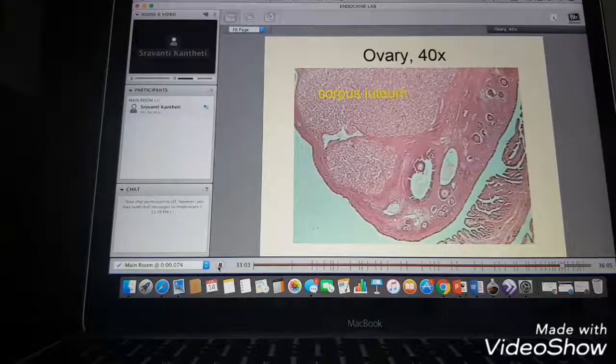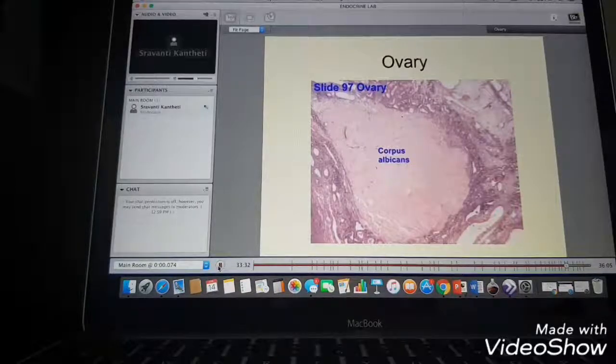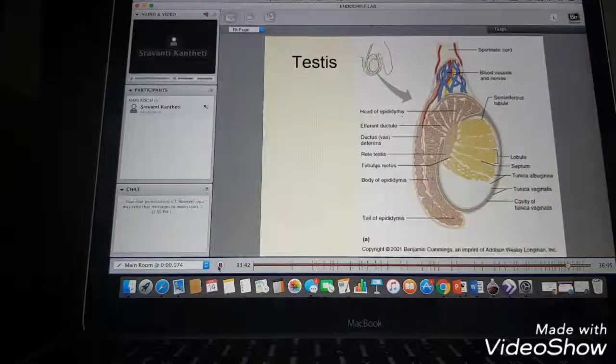This is absolutely neat because this is the egg getting ready to... Oh, let's take a look at that. See? Very cool. Okay, so ton of ovary. We have an entire chapter on this, so don't even worry about all of that. Just know that it's ovary, and here's that corpus albicans. This is, you did not get pregnant, and so we shrivel up and die and turn white and stain it.